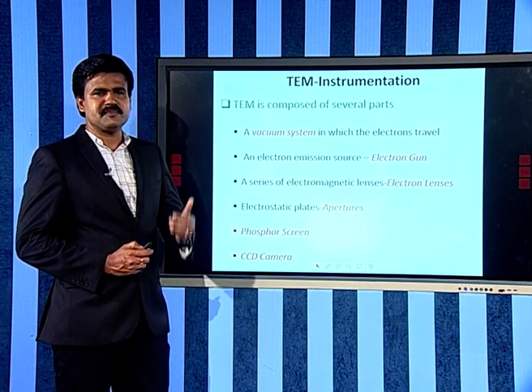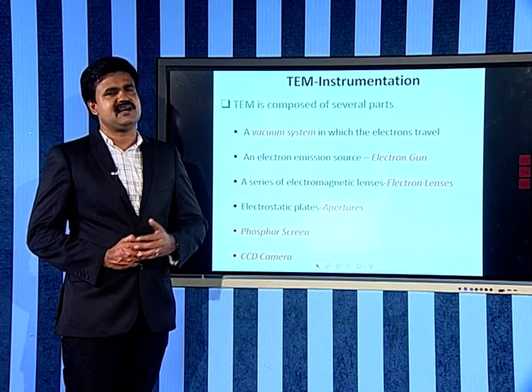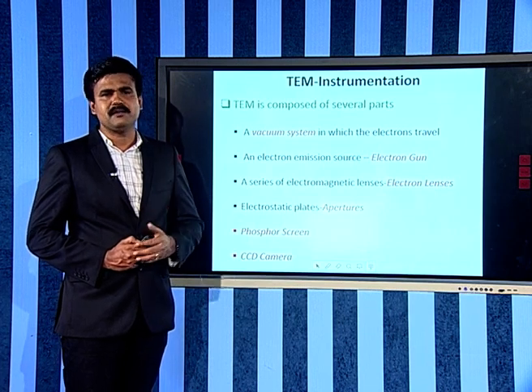Regarding the instrumentation of transmission electron microscope, TEM has several important parts.